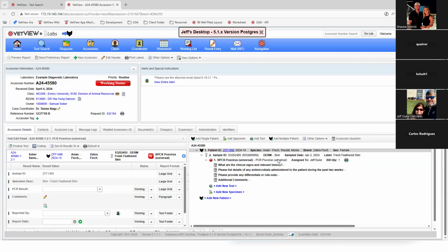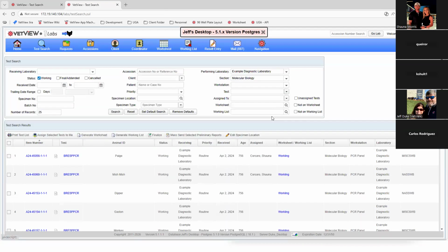You can assign those tests to people, take their name off, put someone else's name on if you want to throughout the system. So that's one of the primary ways of divvying out work, you would say, or having people grab things and manage that themselves throughout the lab.